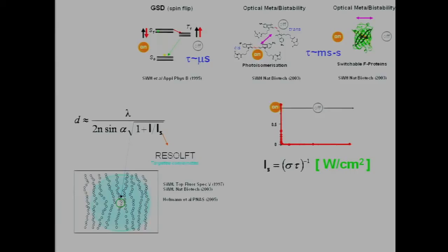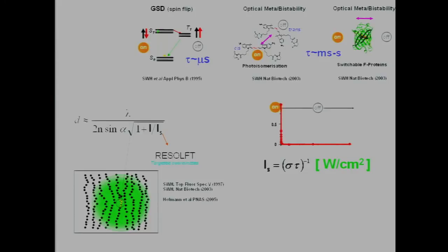Switch off molecules, they go here to the off state, so to speak, and then you flood everything with excitation light. You flood all the molecules, no way out. You won't do any better. But only these inner centers are allowed to emit. The rest will be shut off. And so we see only those, and how do we get the rest? Well, you know it by now. We just scan the beams across the specimen and sort out everything that lies within that 200 nanometer range.